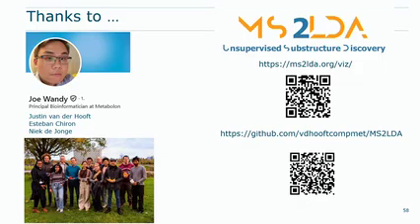So that's also a reason why we changed that. As a nice side effect, it will also be much easier to share your results with others, because the generated visualization files are not that large. The case study file here that you used was 17 MB, and maybe if you have a bit more data, it will be like 50 MB. But you can easily share that as supporting information with your paper. Other people can upload that file into the app and explore and browse the results as well. So that is the philosophy now. And we hope that you will all keep enjoying using the tool. Are there any further questions?